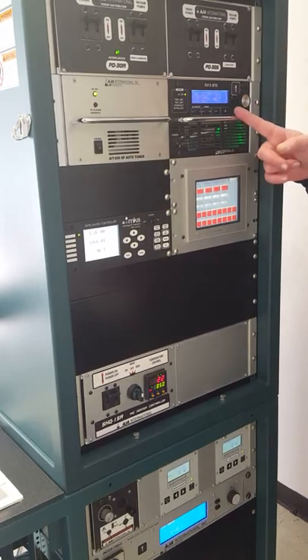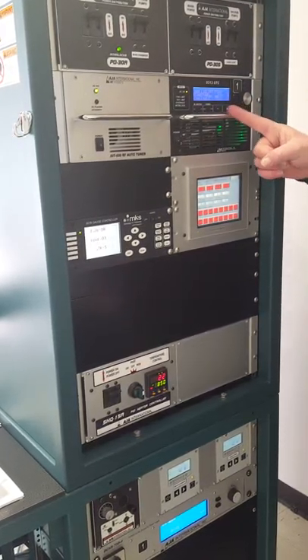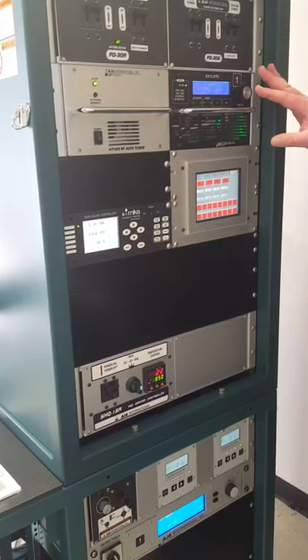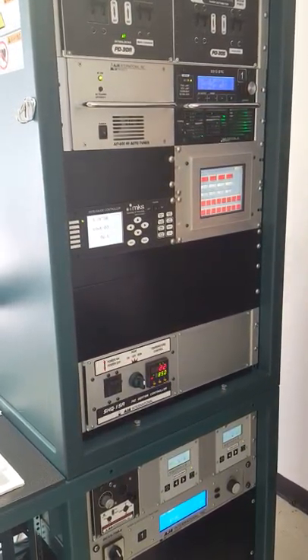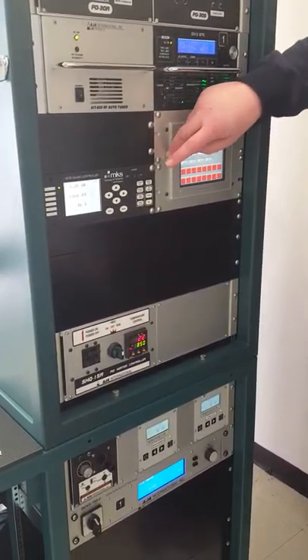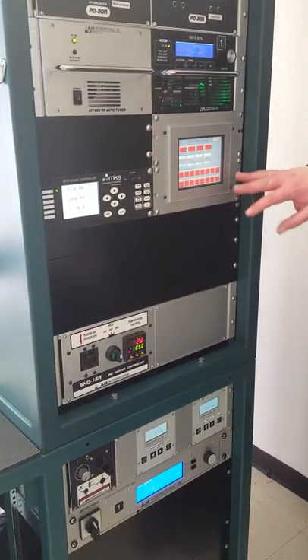We have our RF power supply here with a matching network — we'll go over that in more detail later. This is the touch screen, which has a protective cover over it right now, so it's a little foggy.